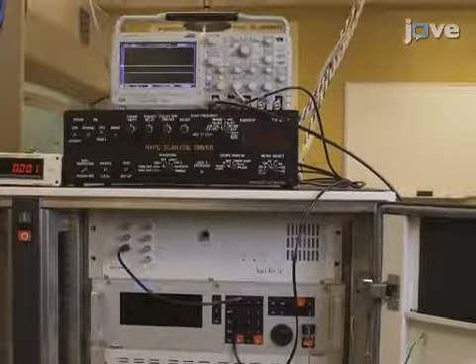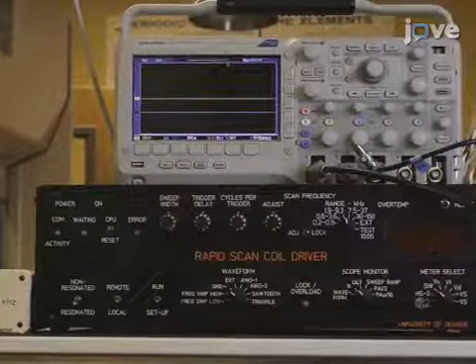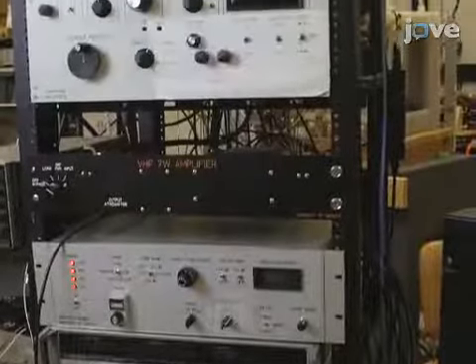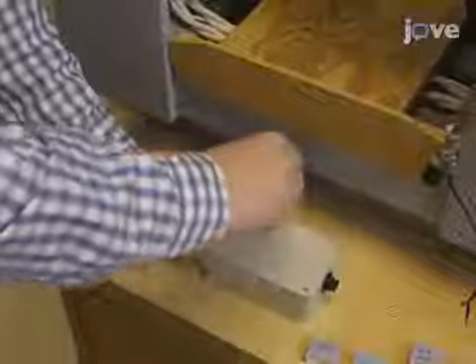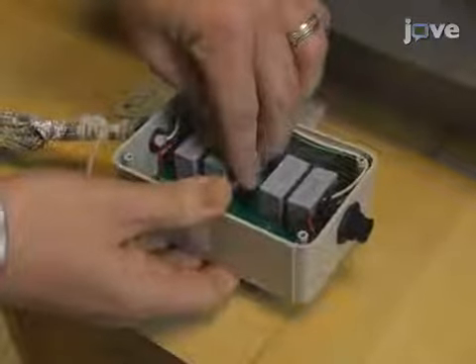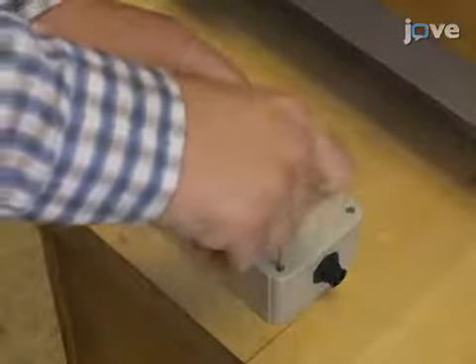The Rapid Scan coil driver has two amplifiers. When selecting a capacitor, the capacitor box needs to be balanced with an equal capacitance on each side of the box. The two sides are in series. Unscrew the top cover of the capacitor box and insert capacitors on both sides that are equal to the determined value. Replace the top of the capacitor box and screw it down to ensure it stays on.